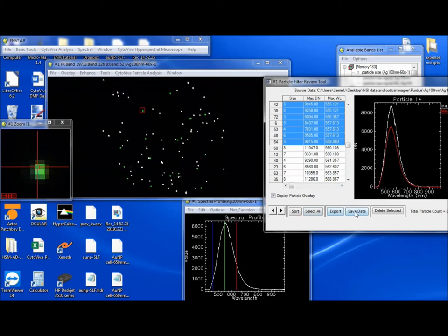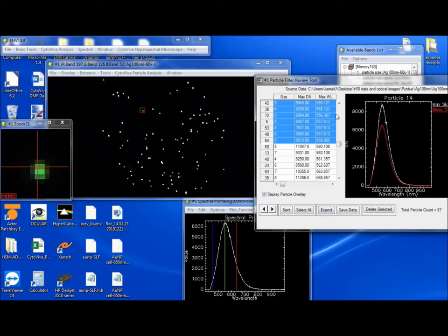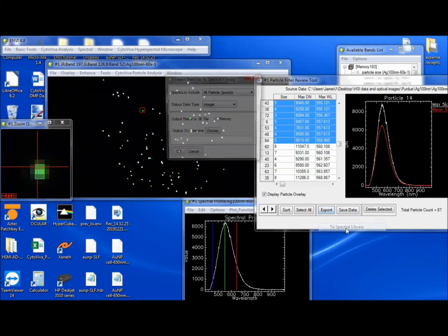And in addition to saving the data, you can export a region of interest and a spectral library. So this is another way to make a spectral library. So what you could do is you could say, okay, I want to make a spectral library of my particles only in these ranges from 550 to 560. So rather than having to go and hunt through the image to find this, this is a good way to do this. So you sort the wavelength, find the range you want, and then highlight just this range, and you can export to spectral library.